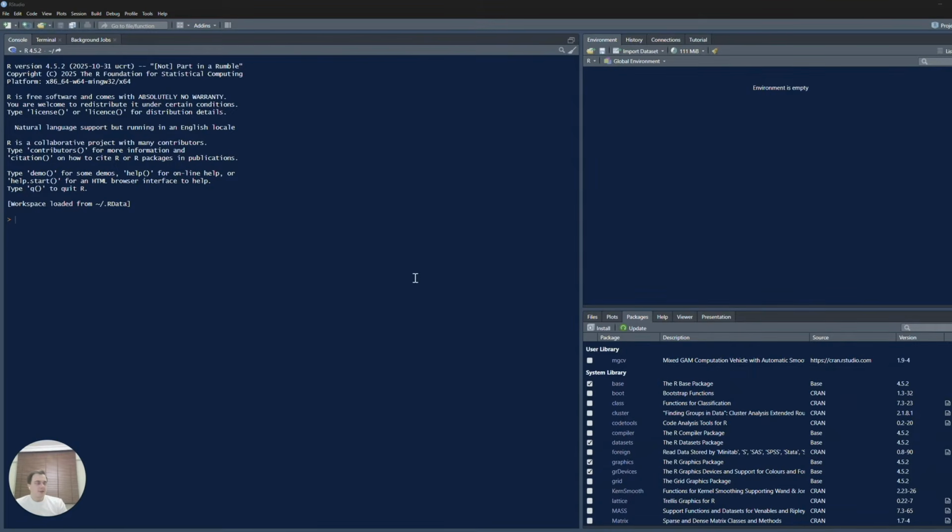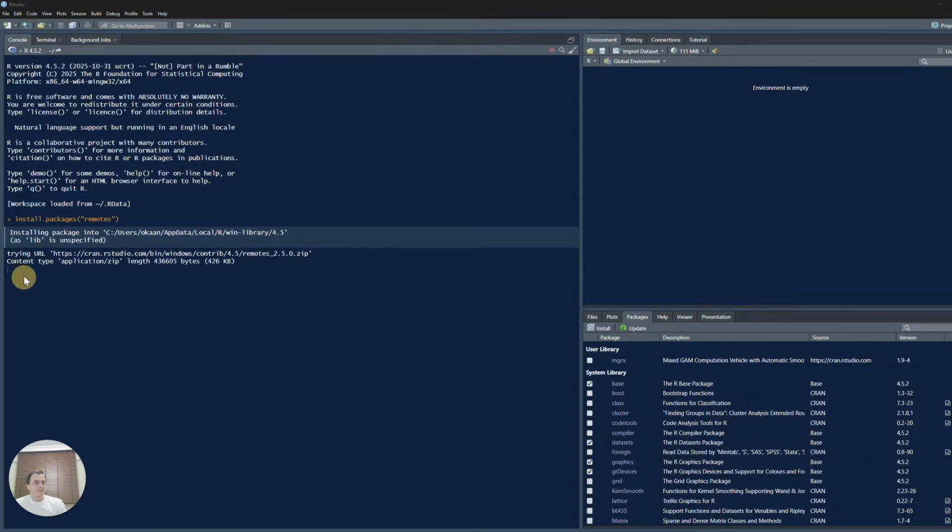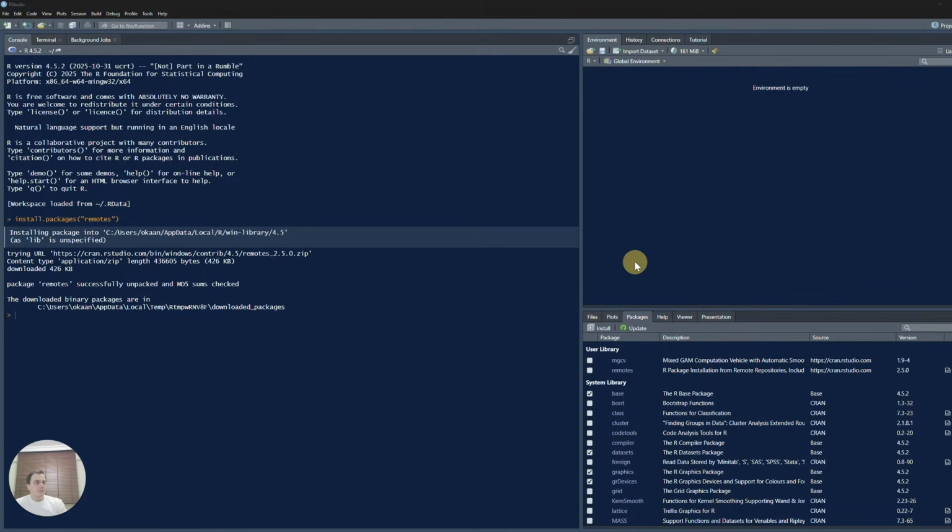The next thing that we are going to do is install the GastroPlus API library with its dependencies. In order to install the GastroPlus API library, we are going to utilize a third-party R package, which is called Remotes. So I will just copy the code from our tutorial website documentation for the GastroPlus API and paste it into the console, and this code is going to initiate the installation of the Remotes package. And I will hit enter. Okay, the Remotes package is successfully installed.